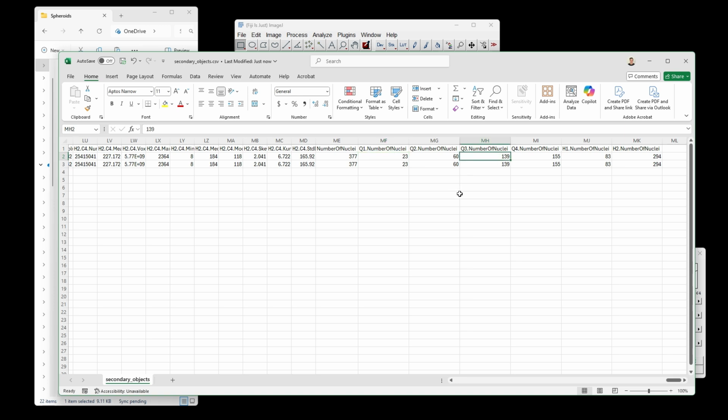And obviously these are not volume normalized numbers because our stratified bands are computed based on distance-wise measurements, because it's the solution that we came up with for this problem. But of course you could go ahead and volume normalize these as well, because you have the volume of each band saved as a record earlier on also.